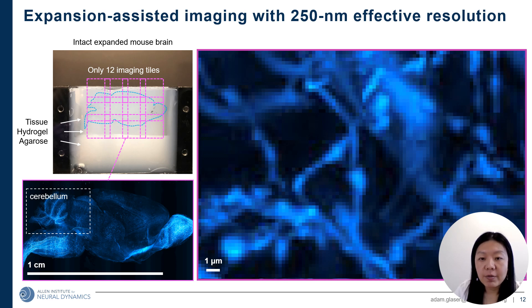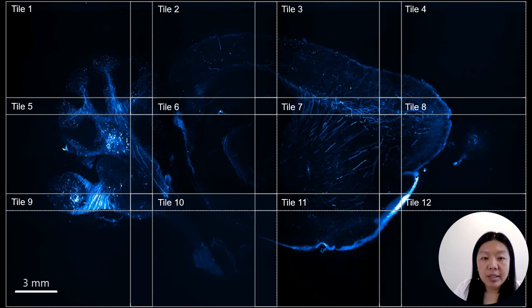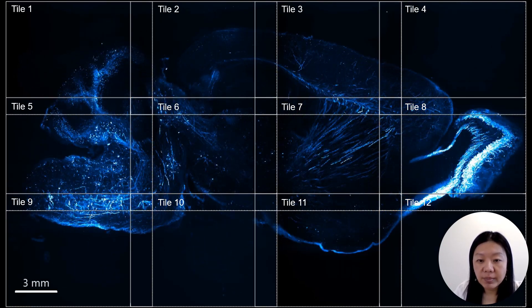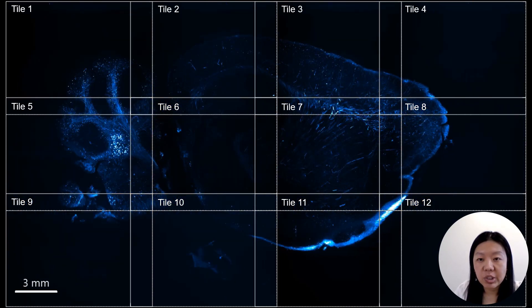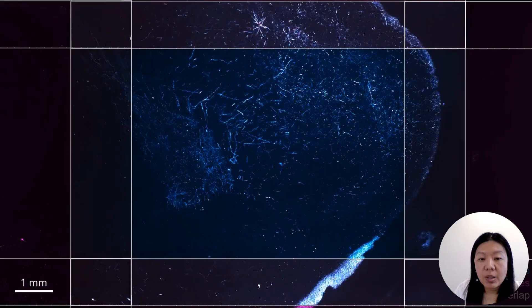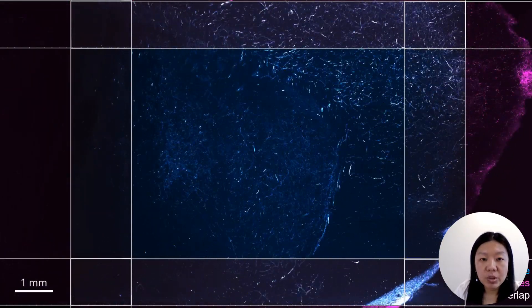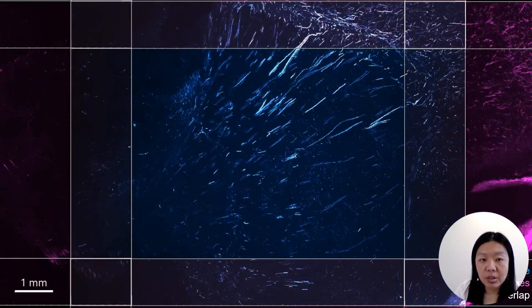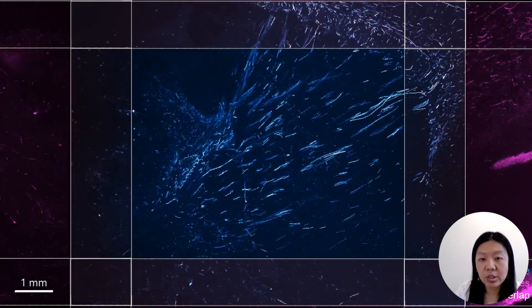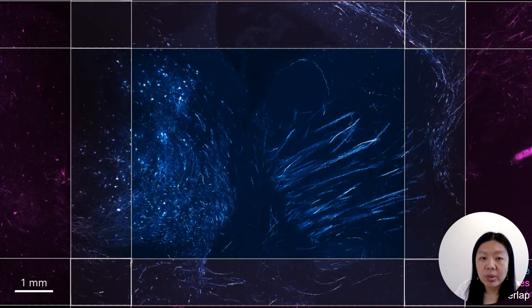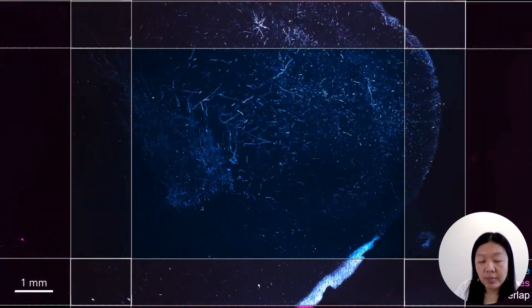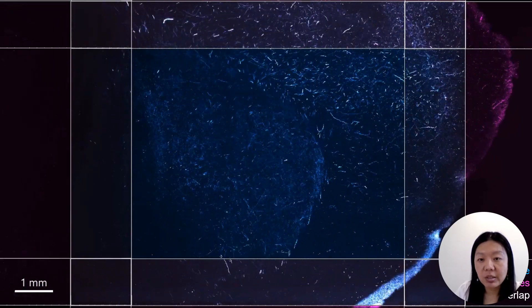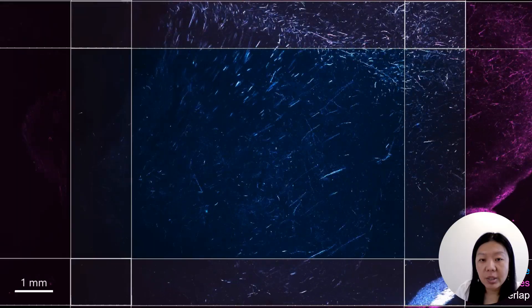Considering the expansion factor of the brain is about 4x, the effective resolution of the system is about 250 nm. In another example, a video moves along the Z-direction for all 12 tiles stitched together. Within the zoomed-in view, we can see the registration between adjacent tiles is very good. This is another advantage of ExaSPIM: shorter imaging time leads to less tissue distortion, and the reduced number of tiles reduces the amount of work for registration. Even with naive registration based on stage coordinates, the result already looks very good.